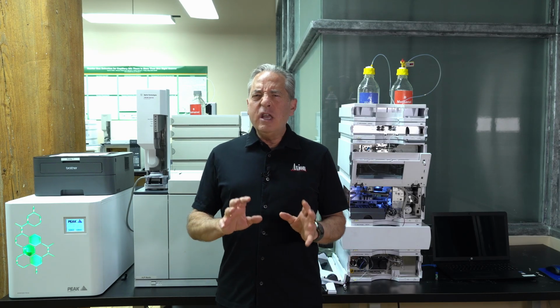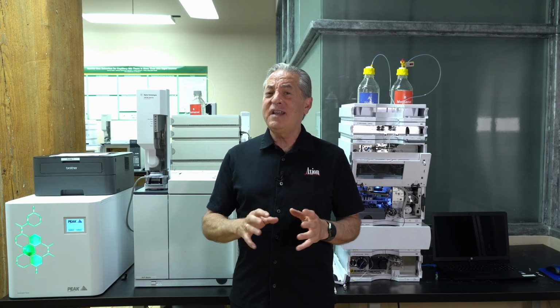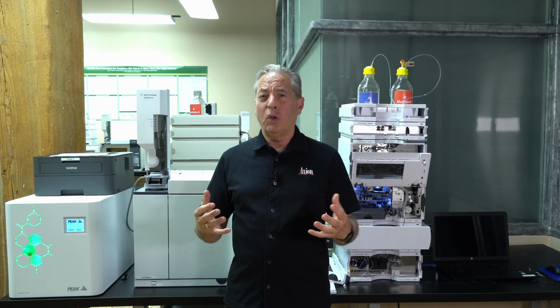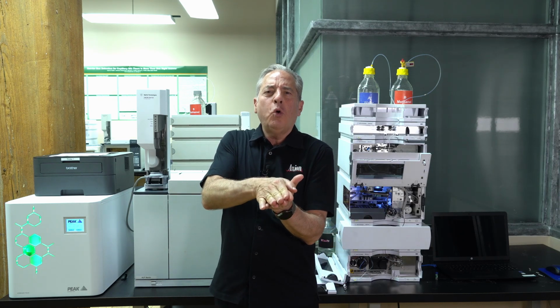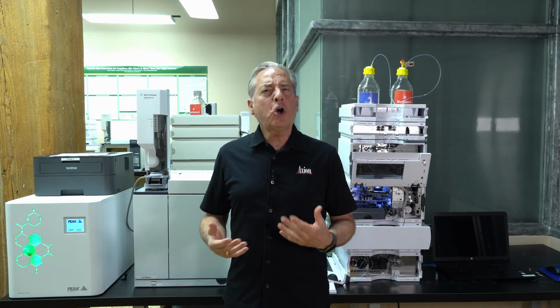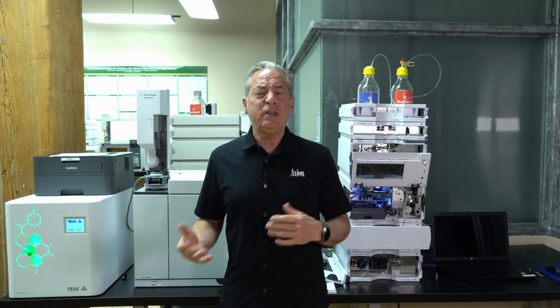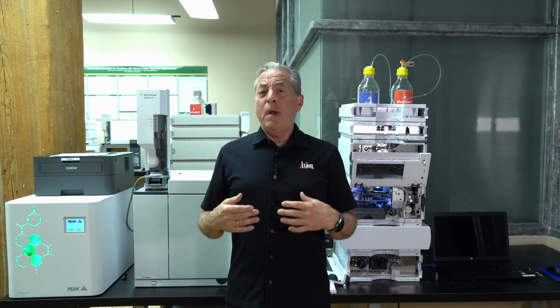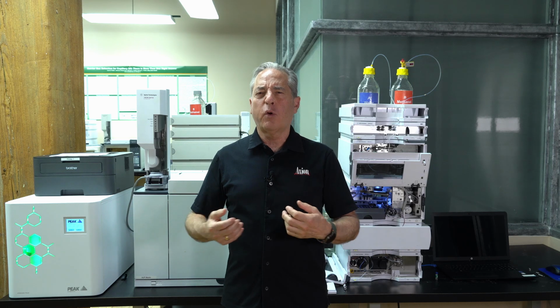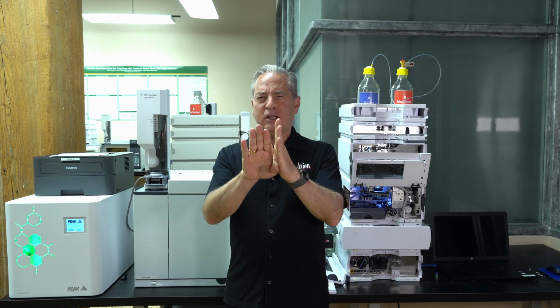So another thing the interviewer may want to know is, do you understand the separation? Remember, we've already established that chromatography is this separation tool. So how will the interviewer probe your knowledge of separation? One question might be, what's the cause of poor resolution in GC and in HPLC? Remember, GC and HPLC are separation tools. We need to resolve peaks. So if we have poor resolution, it means the peaks are stuck together.